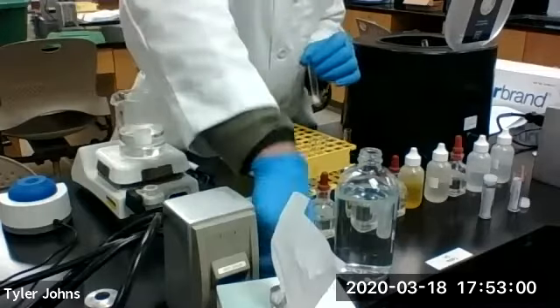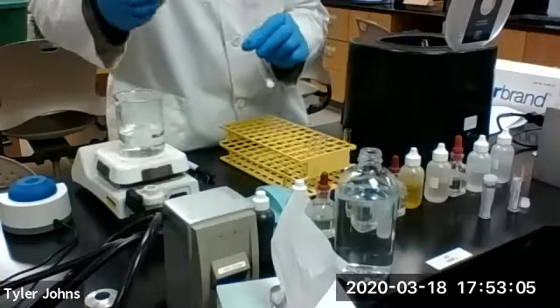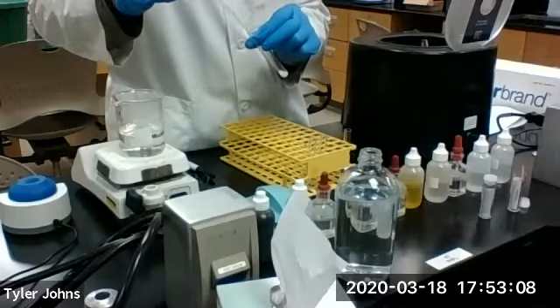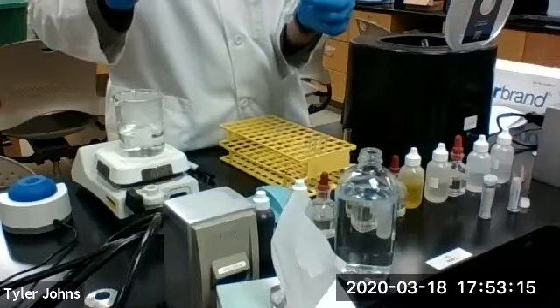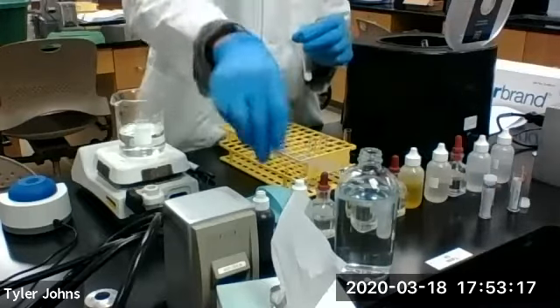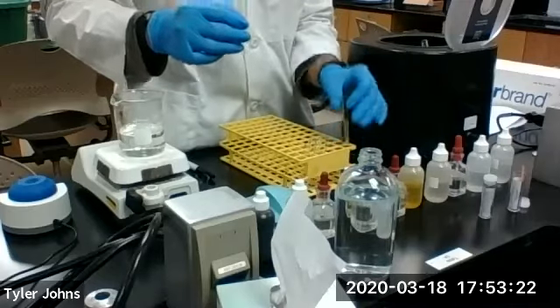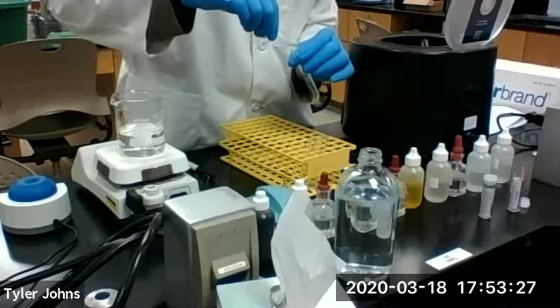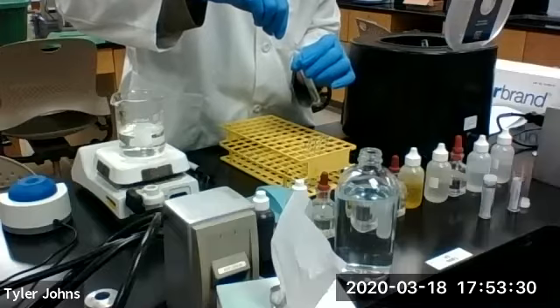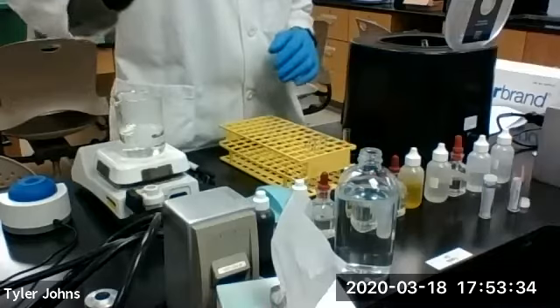And we're going to wash the precipitate with just a little bit of water. And we'll discard the wash as well. So we were left with just our precipitate.